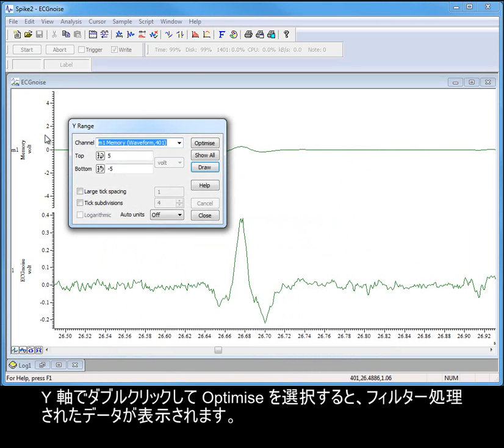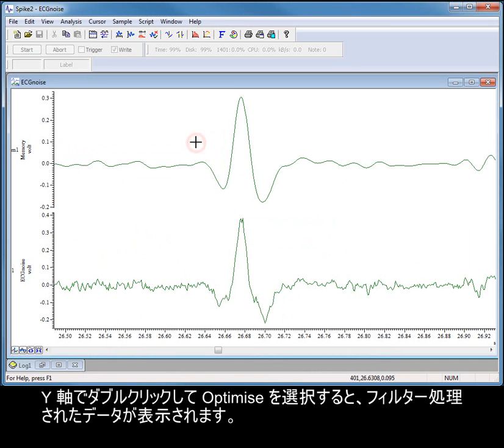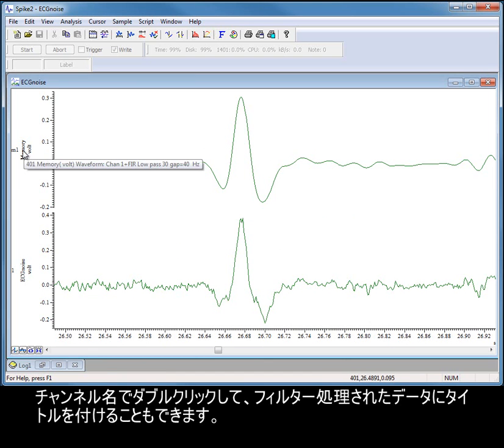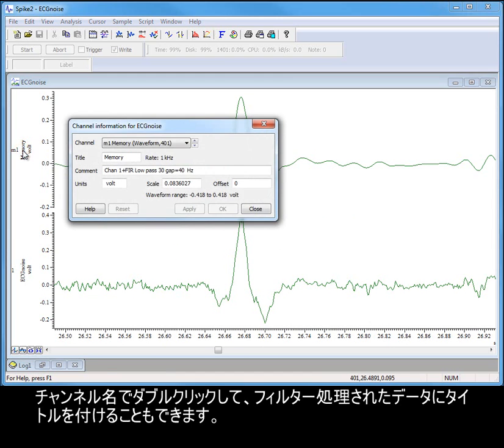Double-clicking on the Y-axis and selecting Optimize shows us our filtered data. We can also give our filtered data a title by double-clicking on the channel name.